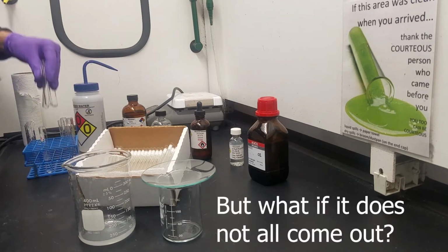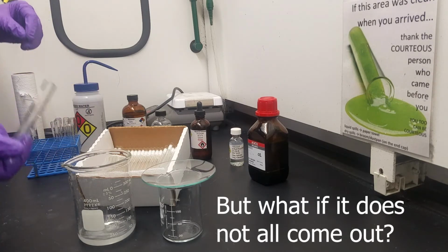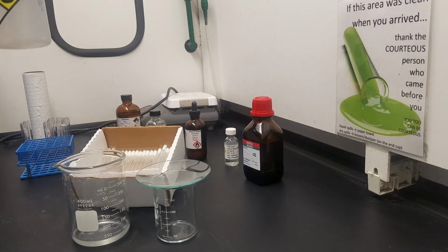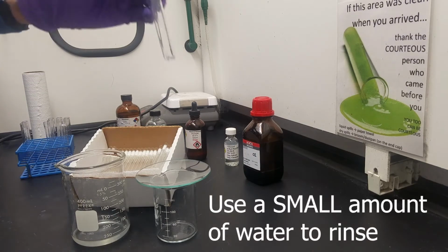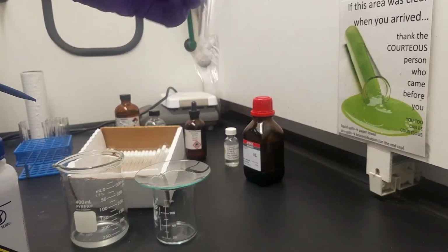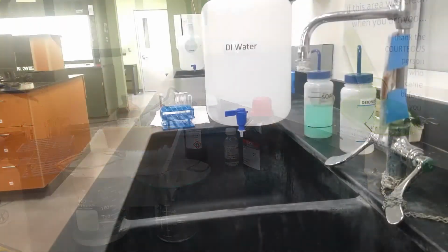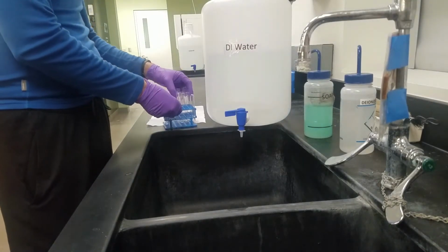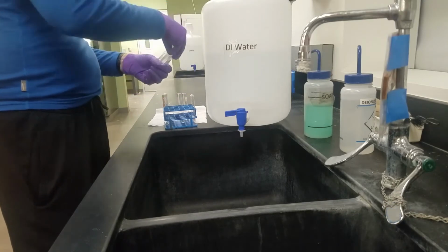Okay? Once it's all disposed of, or you happen to notice that it doesn't all come out, that's where you could go through and do a small, being the operative word, water rinse. Okay? We're not filling up the test tube. We're doing a small splash of water, a milliliter or 2 at most, and we dump it out. Whatever still sticks behind can be washed in the sink. The sinks do trap some waste, they just don't trap it all. So we have to get the majority out before we start our cleaning.